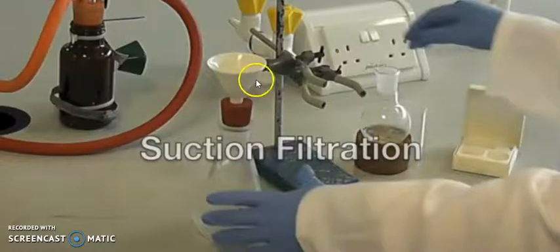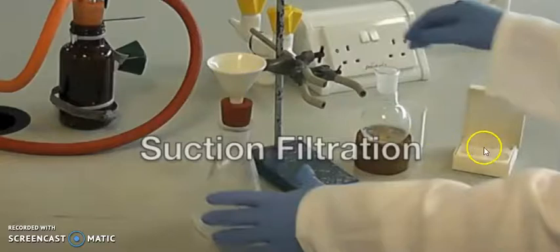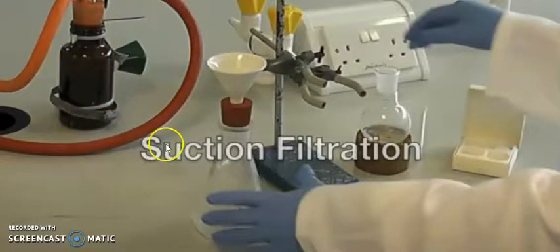You need filter paper according to your Buchner funnel. So this is the filter paper. Then you need pressure. So you make the equipment like this, then you can see how you will do the suction filtrations.